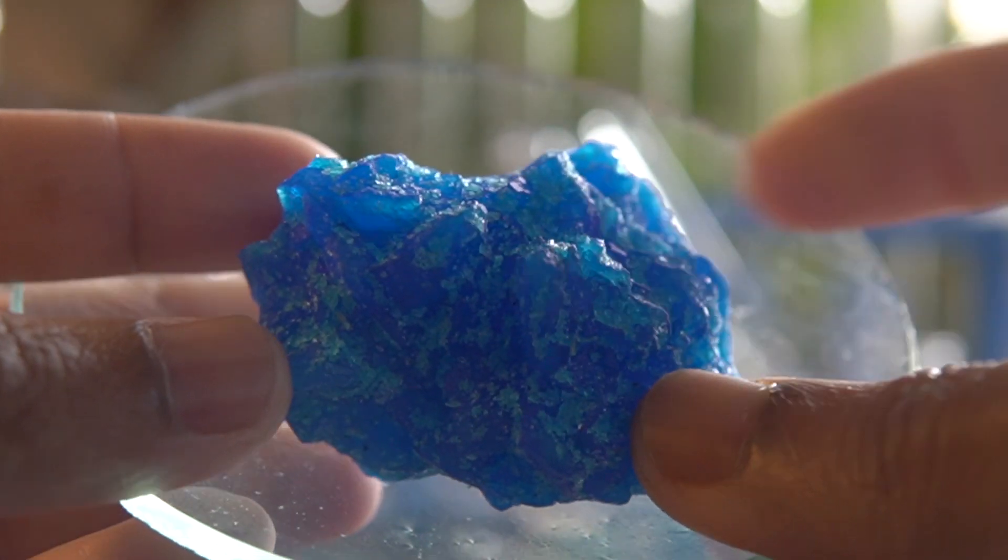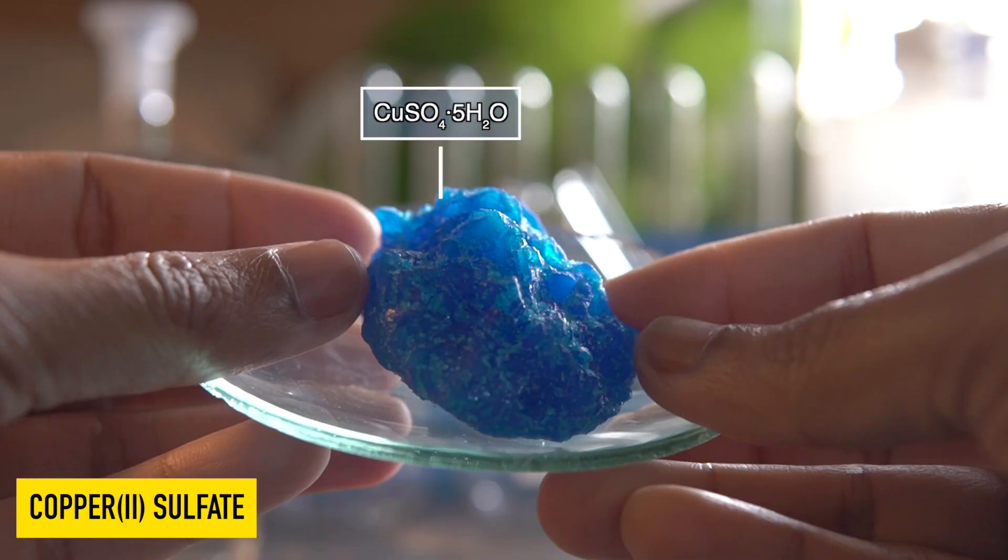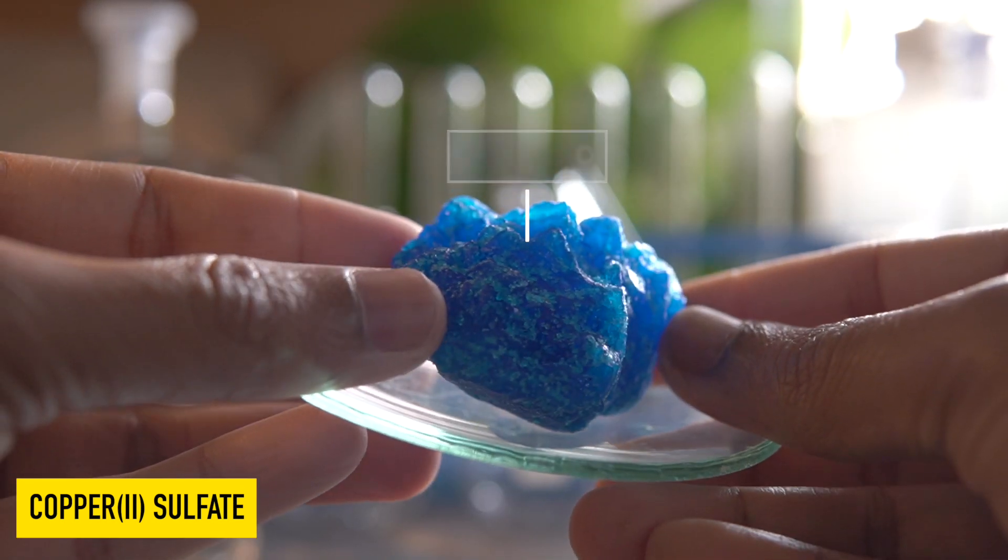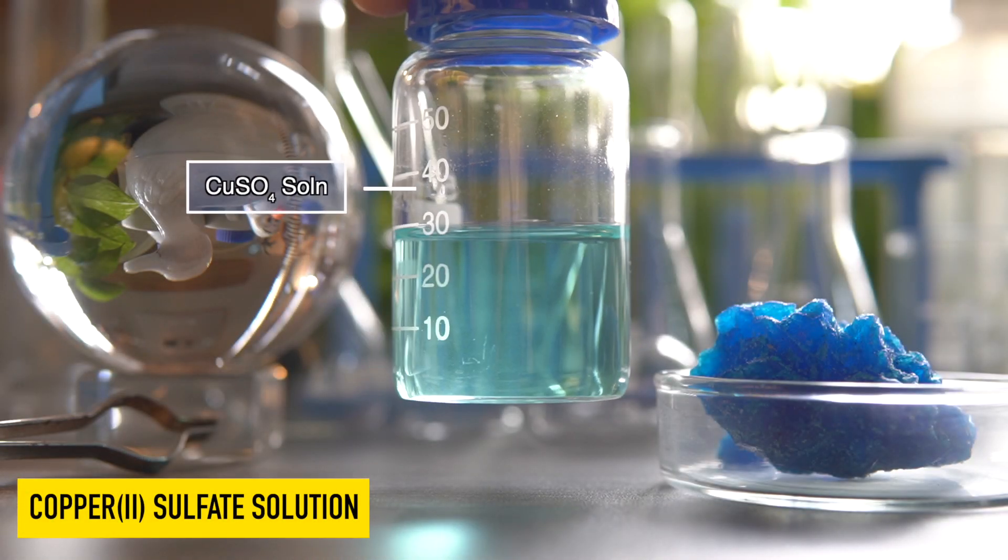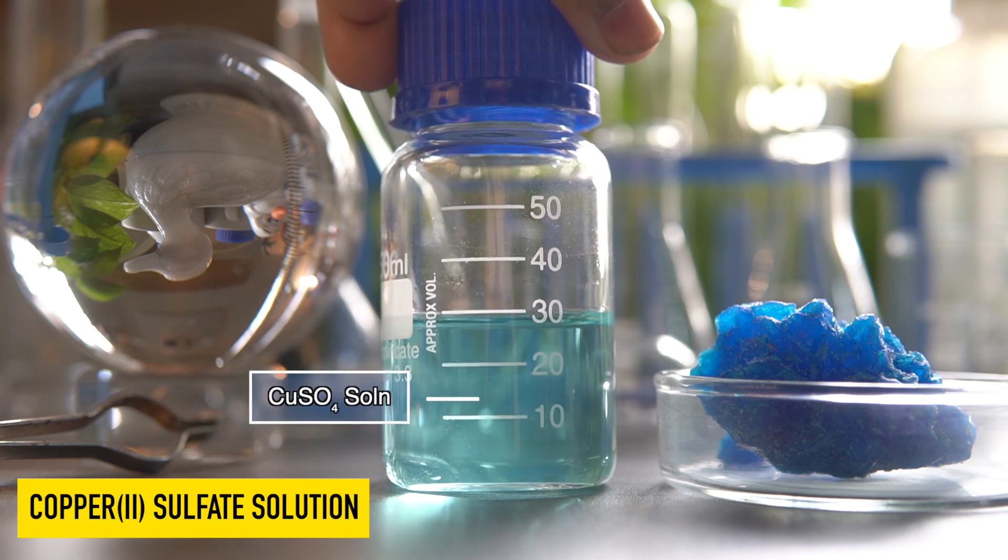This is copper sulfate, it is blue in color due to the presence of 5 molecules of water in it. It is commonly called blue vitriol. It is highly soluble in water and can easily dissolve in water to make a solution.